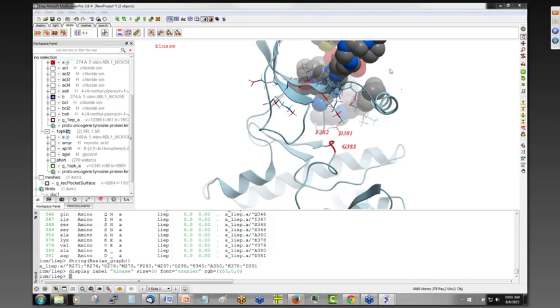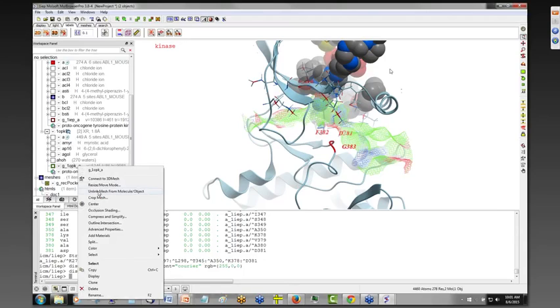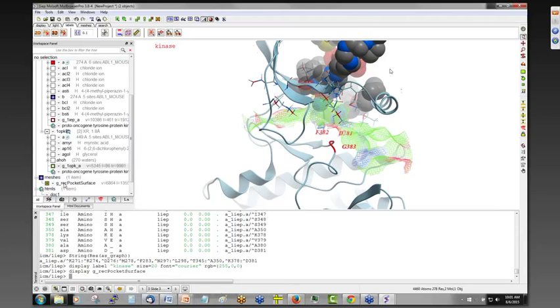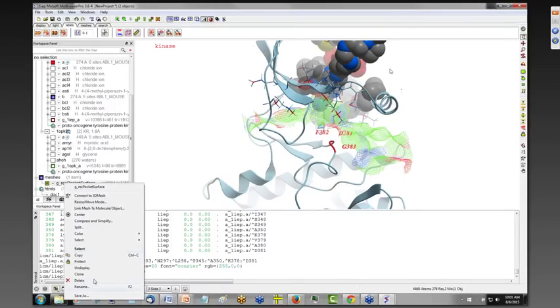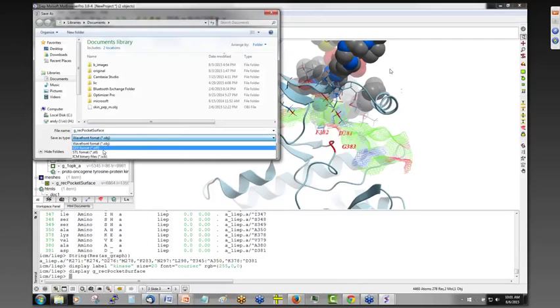Yeah, that's a nice question. Can you export the Pocket mesh as a volume file? Yes, you can. At the moment, we have a mesh here, and this mesh is connected to this protein, so we'd have to move it out. So right-click and say unlink mesh. Once it's exported, you can save as, and you can choose object file, .obj format or STL format for 3D printing, and this other 3D format here.